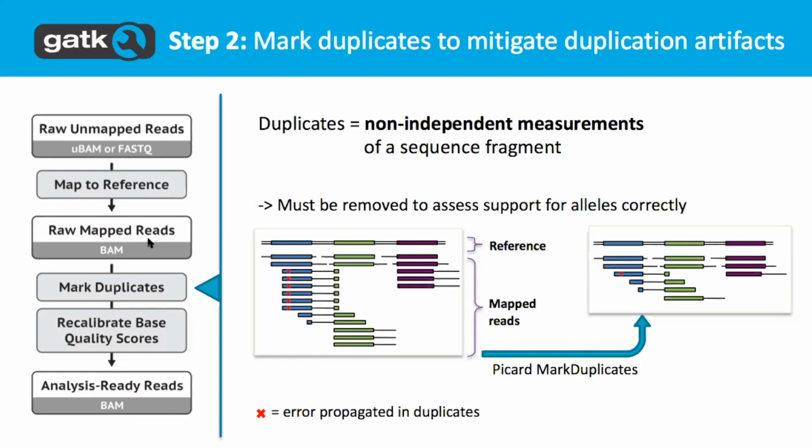Because anytime you change your aligner, if we were to analyze different data sets aligned differently, we get batch effects. And there was a recent paper, I think, about batch effects in 1,000 Genomes that highlights that.